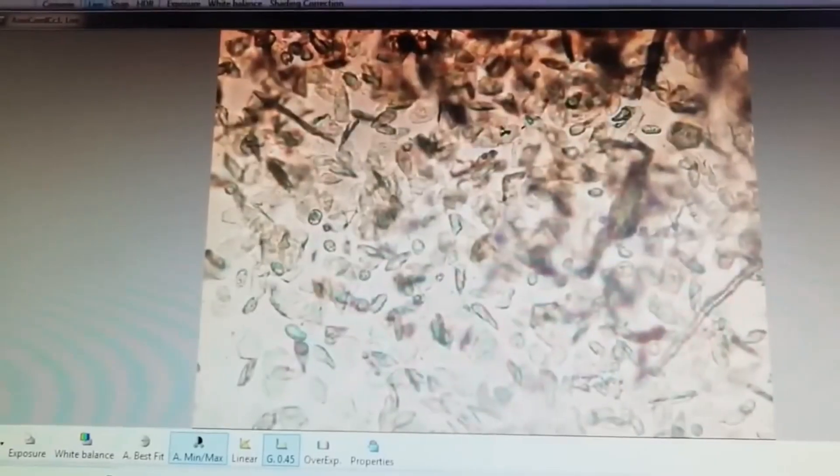Now on screen you can see proestrus phase. Here it has nucleated cells with cornified cells. Generally it is a preparation phase for the estrus phase, so it is mixed and in transition phase. That is why it is showing both nucleated and cornified cells. It is in the stage of transition from proestrus to estrus phase.